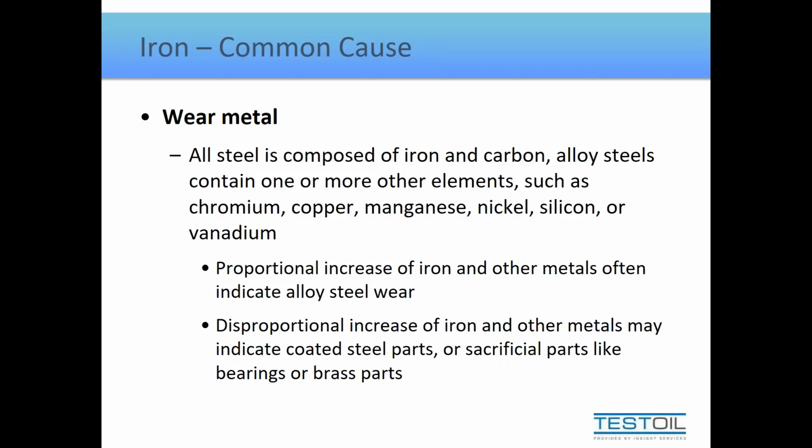Now, what about iron appearing that might not be due to wear metals? If you see a sample and iron is increasing, but no other wear metals may be increasing significantly at the time, yet you note an increase in calcium and magnesium as well. A common go-to for folks when they see calcium and magnesium increasing is to assume hard water contamination. And that certainly may be a source.